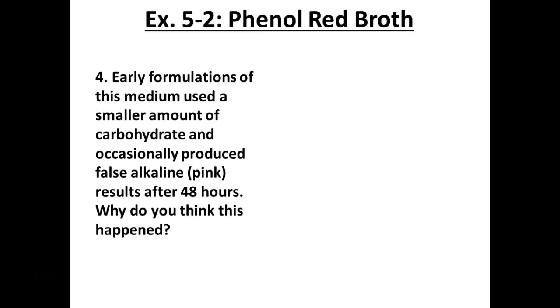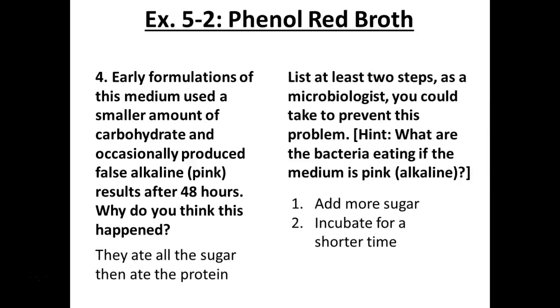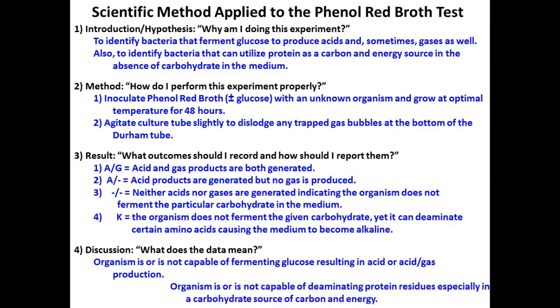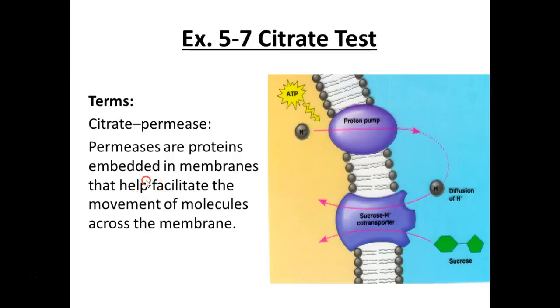So how could we fix this? Well, we still incubate for 48 hours, so what do you think they did? They put more sugar. Or we could, what? Instead of adding more sugar, instead of incubating for 48 hours, do it only for 24, right? Less time. Yeah. Peek in on them sooner. See what they've done. So I kind of fibbed about the early, huh? But that's okay.